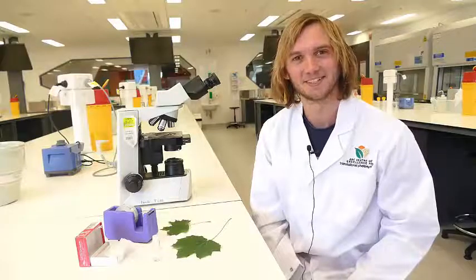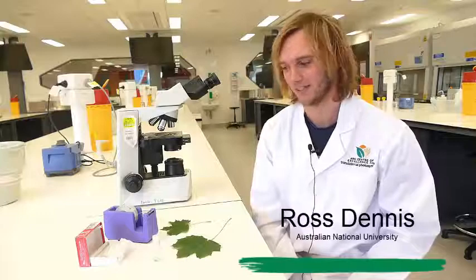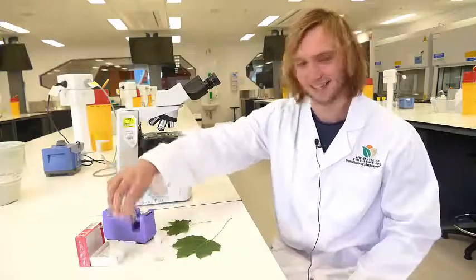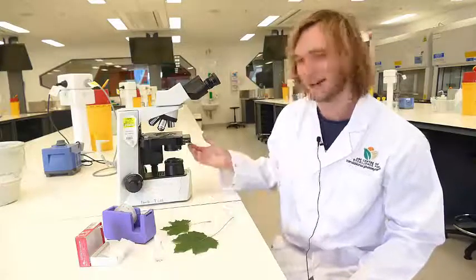We will make a slide to view the stomata and the epidermal cells on the surface of leaves using clear nail polish, sticky tape, a glass slide, some leaves, and a microscope.